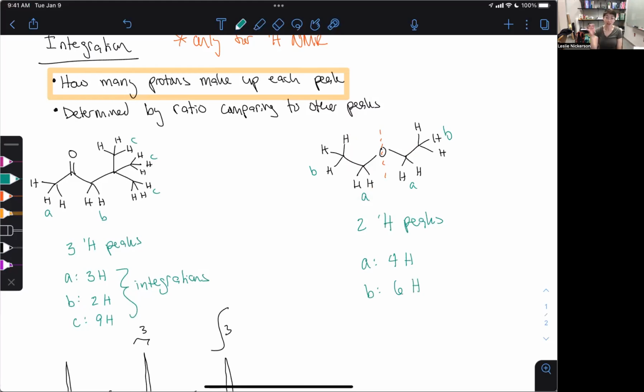Okay. So this is a situation where if you see a proton peak and it integrates to 4, you need to think really carefully about what that 4 could mean. Because that is 4 individual protons that are in identical environments. So unless it's methane, where it's just CH4, you have to have something else going on symmetry-wise.